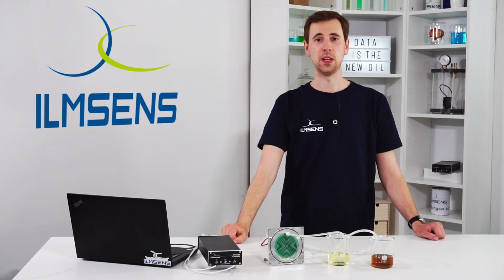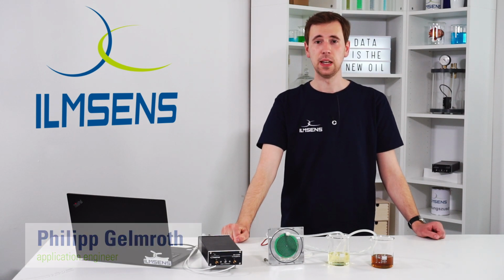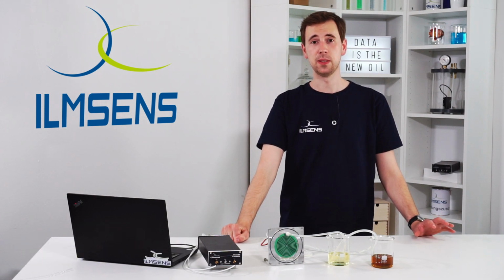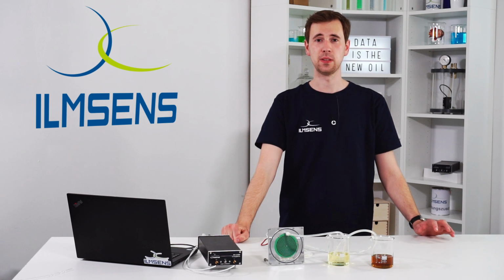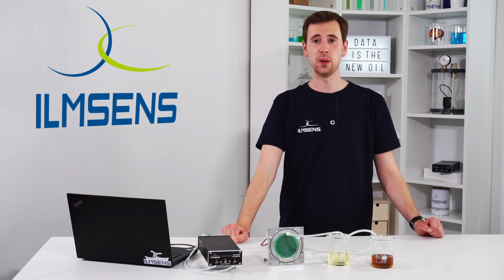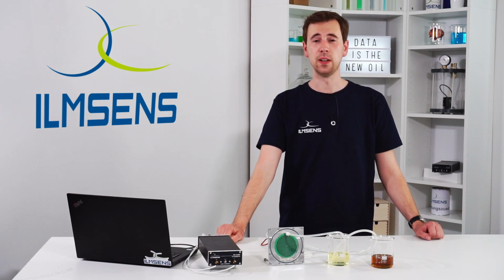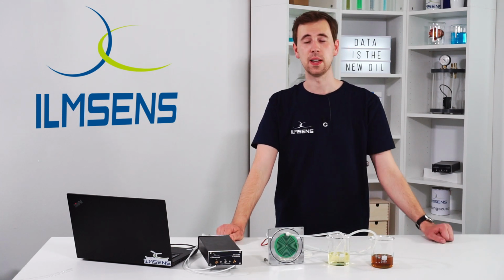Analyzing and distinguishing between different liquids is often a rather costly and time-consuming task. Time in which possible mistakes and failures in your process stay unresolved. In this video, I'd like to show you how, by using the Ilmsens ultra-wideband technology, we can analyze two different samples and distinguish between them using two different oils as an example.